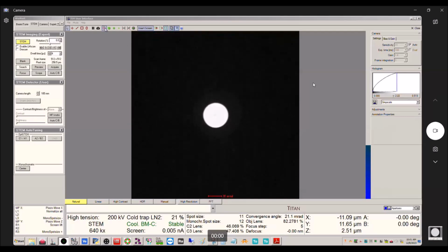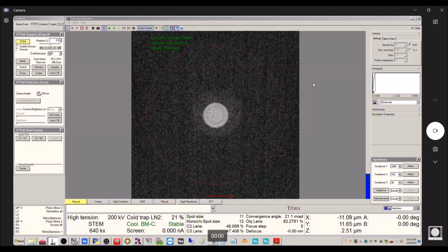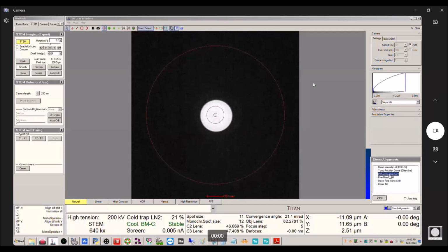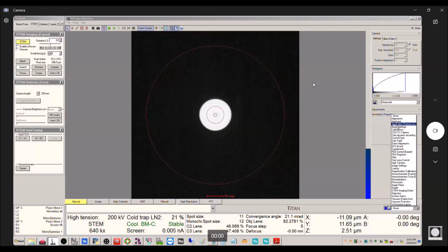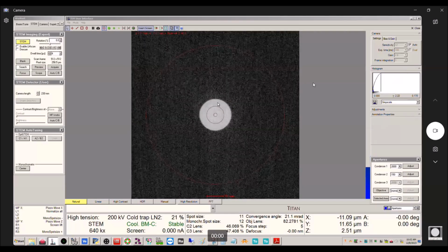Okay, so now turn on your screen markings. Let me bump this up one more click. Okay, but now this is critical here because this is defining, right? Because we're going to be changing the apertures here, okay? But this will define our center position now, because we're going to have to put in the bigger aperture here to do the tuning, just like we would with unfiltered STEM, okay?